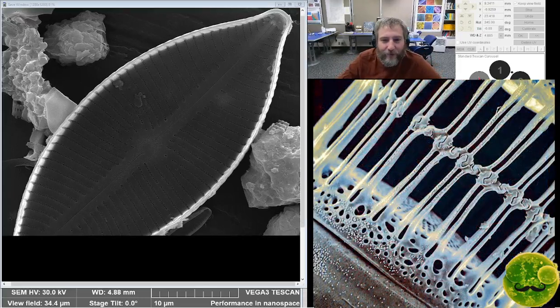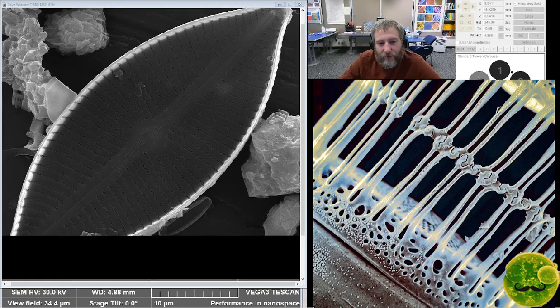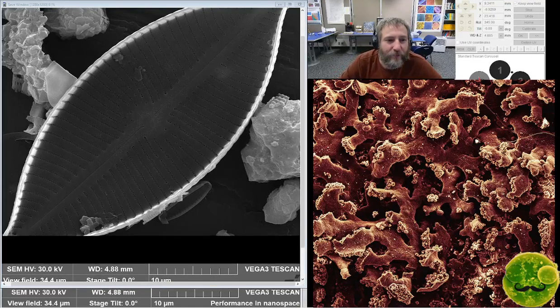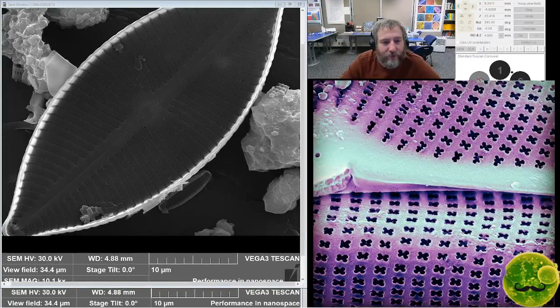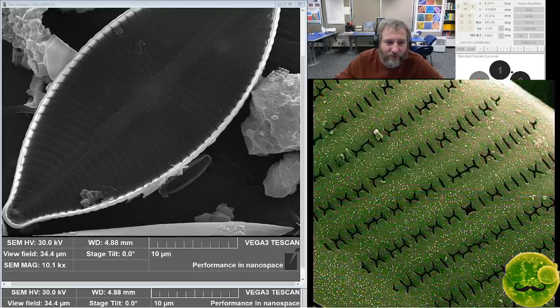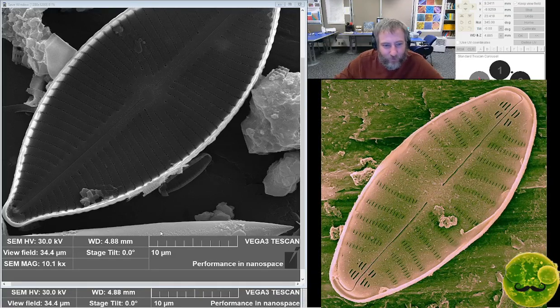I had to look through it for a while, like every other sample maybe would have one. I usually just put them on a slide with no cover slip, and I'll pipette all over the surface so that almost the whole slide is available for surface area, because typically I have to look through a lot of it in order to find them. But usually there's nematodes and rotifers and water bears together, and they're pretty commonly found around together. But that was my big change, just switching to sticks, and somehow that mattered enough to make it work.